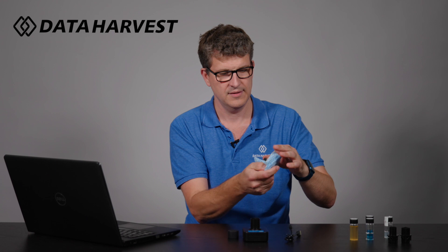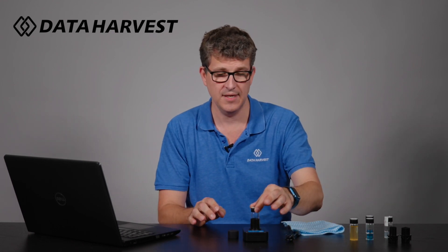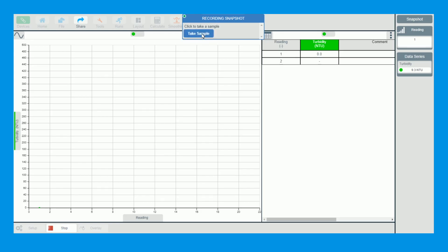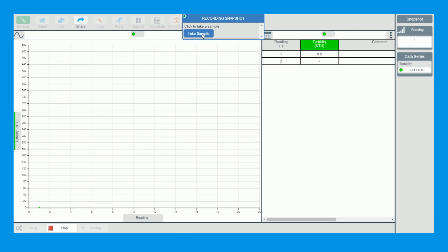So we're going to go to the second sample. The cloth does come with the pack. I didn't agitate it — let's just do that very slightly and pop that in. We now take a reading. As we can see that's 92 NTU, which is absolutely brilliant.